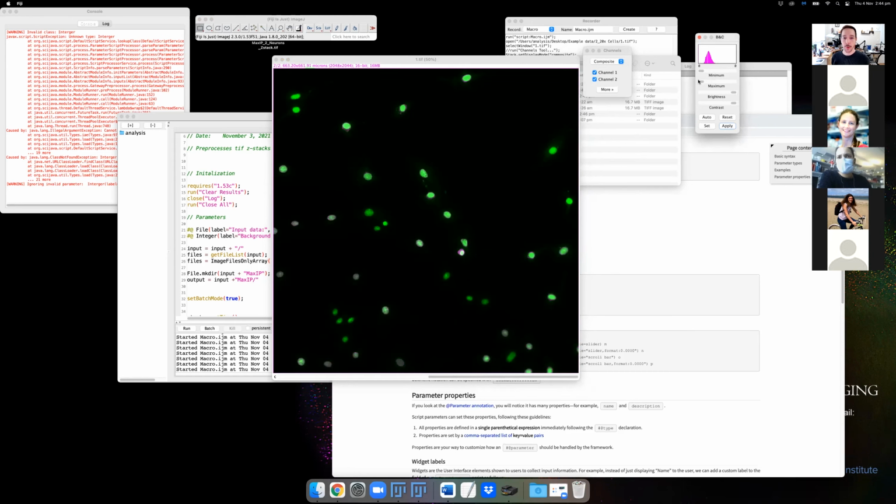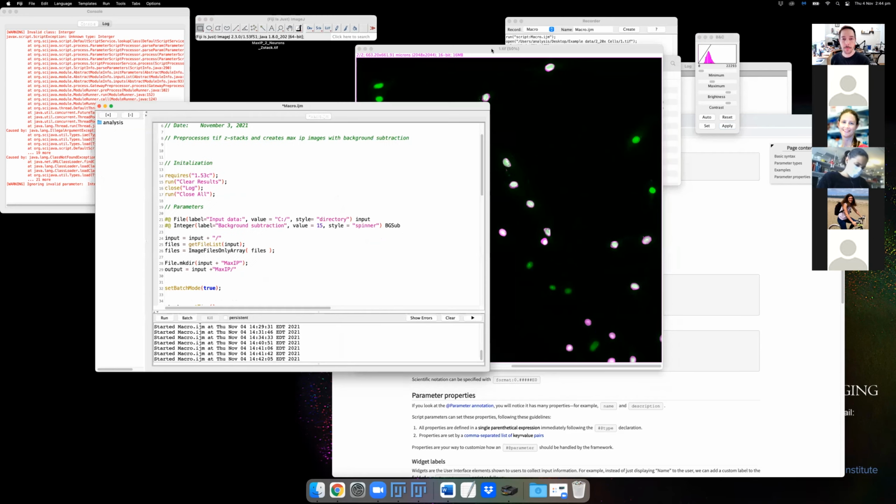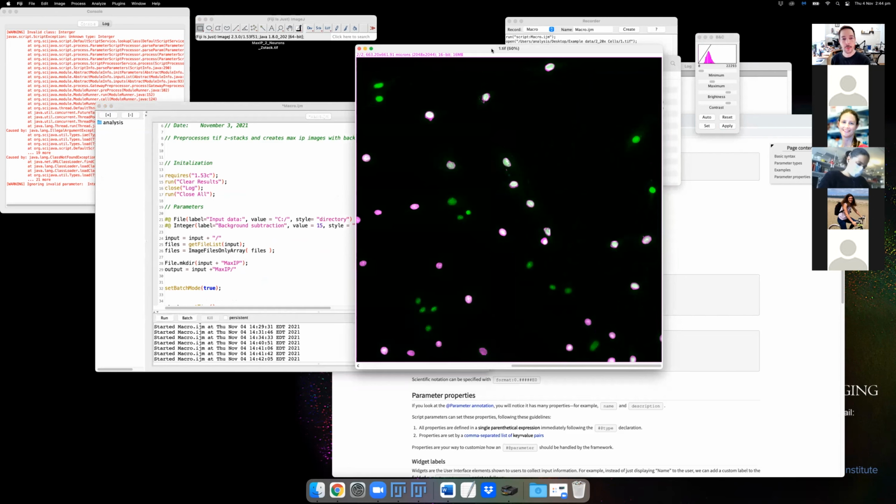You can see here now, these are cells that aren't expressing this other protein. This is any kind of problem you have in tissue where you're trying to quantify cells and check for expression. Often people will try and tackle this manually, but it is quite an easy problem to solve with some scripting. The first thing that we want to do is detect the cells that are the main population. So what we can do is just split this image.